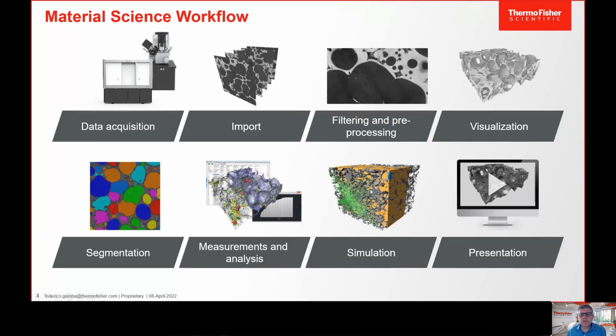Optionally, people want to simulate, especially in digital rock, it's a common thing, but not only. In any porous media, we have simulation available in Avizo and PerGeos, so you may want to simulate the permeability, for example. So we will see a bit of this. It's common to do that.